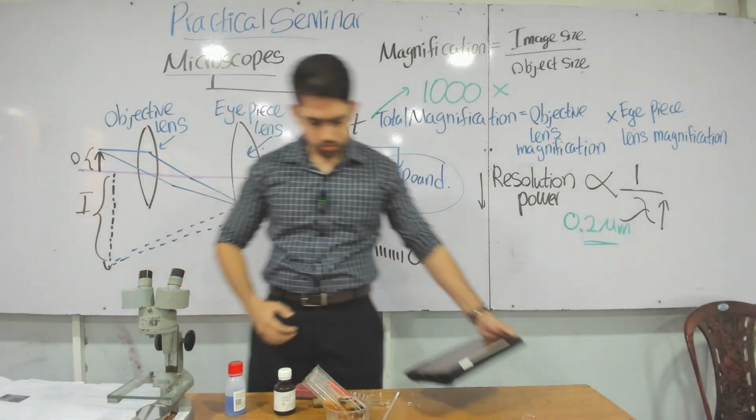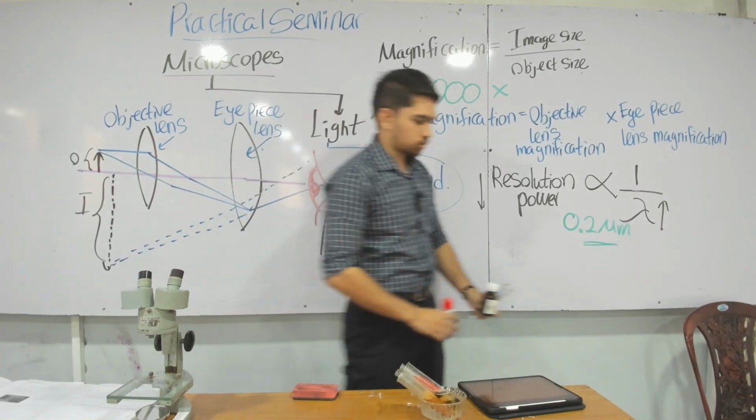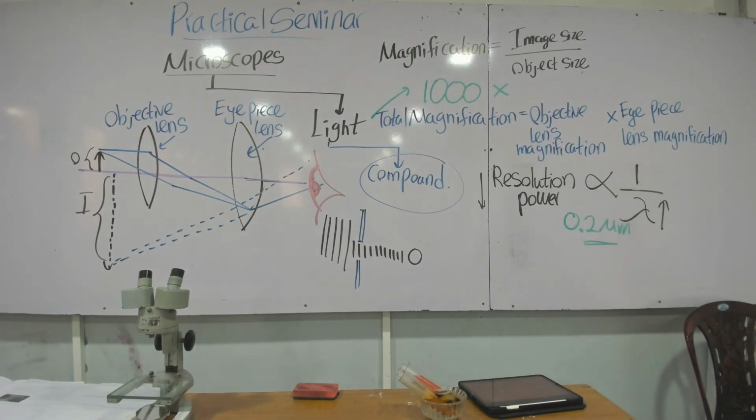Next up, we have to identify the parts of the light microscope. So now you know the theory: lenses combine to produce the total magnification, but the magnification is limited due to resolution. Now we are going to see the parts. That's what the early microscope looked like. Last week we talked about Robert Hooke. He had a basic tube and lens, but it didn't have most of the other things, such as the ability to focus. We are going to see these in a modern light microscope.